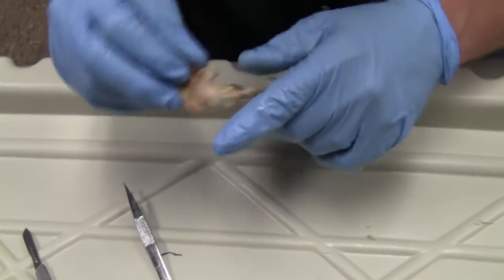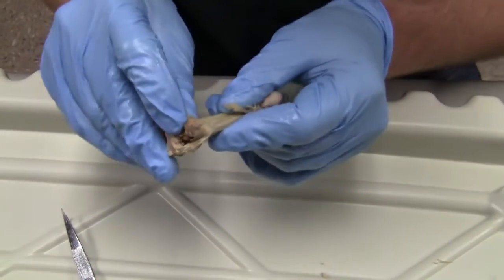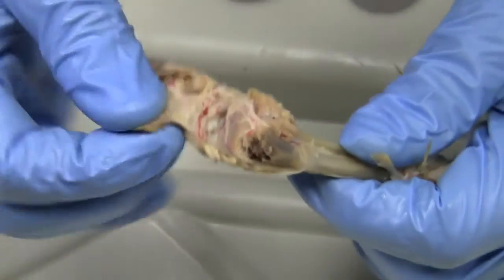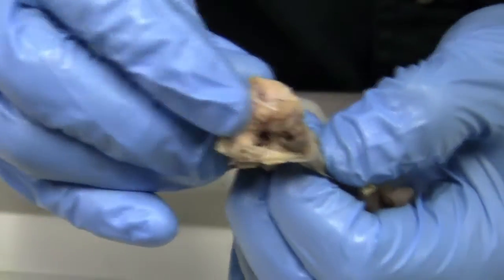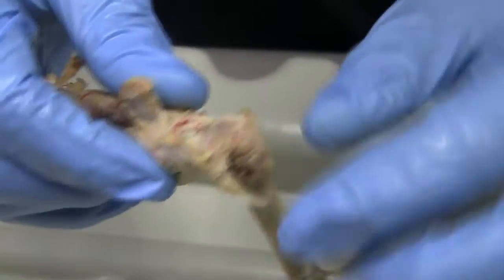One thing I really want to show you real quick is when you do hyperflex, you do have the chance of breaking it right at the growth plate. So this is my practice one. This is not as cleaned up. You can see that the distal head, or the proximal head of the tibia, is still in the knee joint. So that's your growth plate.